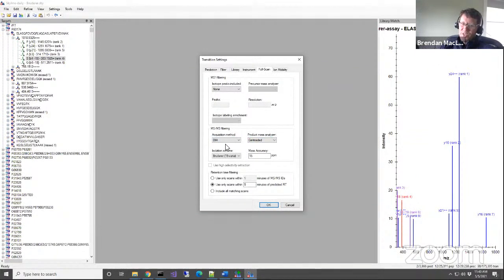There is a centroiding algorithm that SCIEX has that we have used on their TOF data, which has had a slight improvement, but it requires running an external tool and creating a second file. So there's enough complexity that at this point it's not a big enough benefit that I would tell a lot of people to do it. So I say, if you're using SCIEX data, go with TOF.